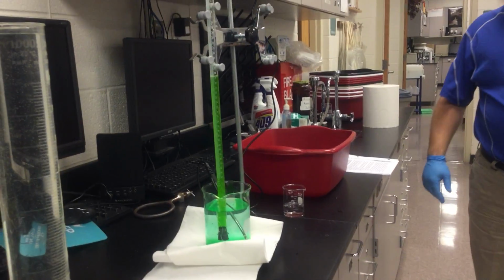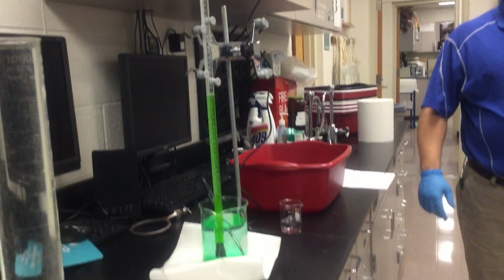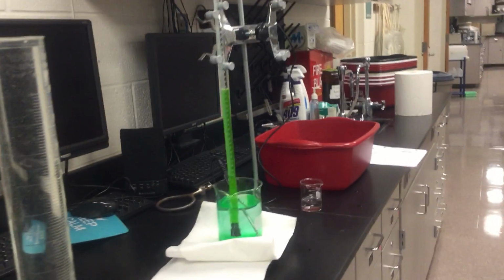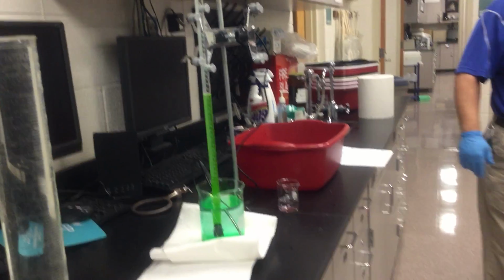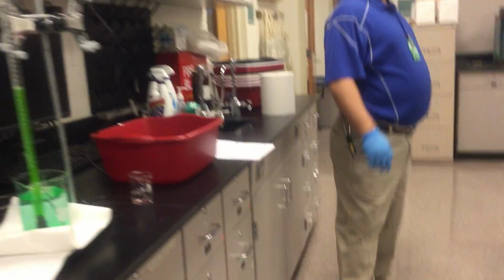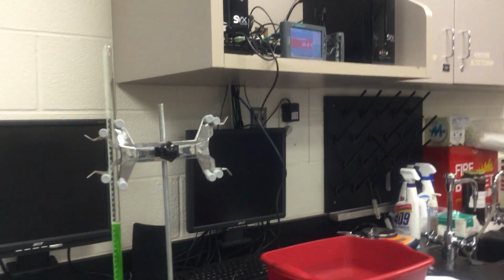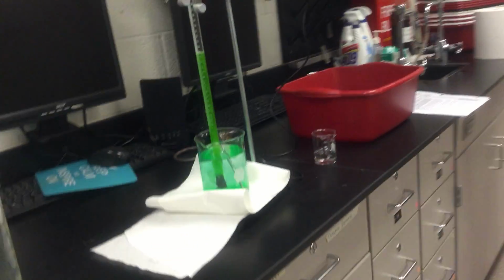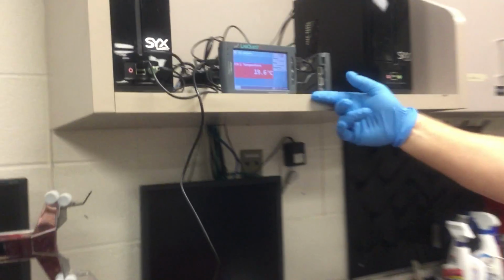But as you can see, it's bubbling pretty good, isn't it? What do you see about the temperature? It's going up a little bit, right? You might want to make a note that the temperature is increasing a little bit in my water bath. Okay? Temperature is increasing slightly. Did you get a picture at temp? Yeah. Up there, Kyle, for me.